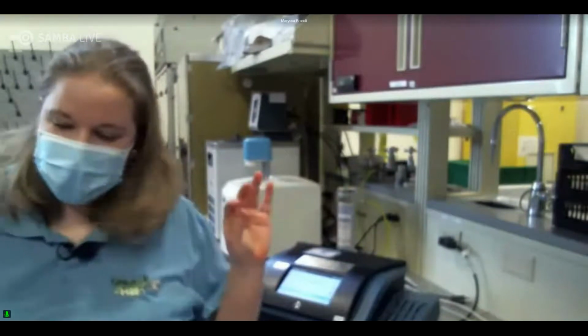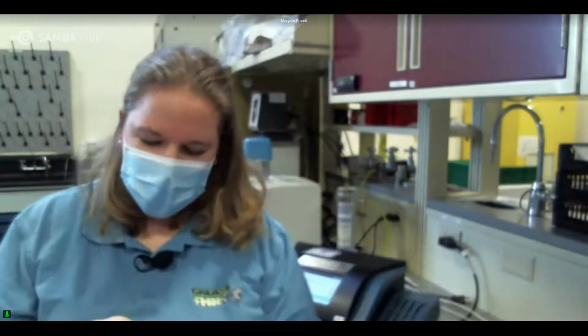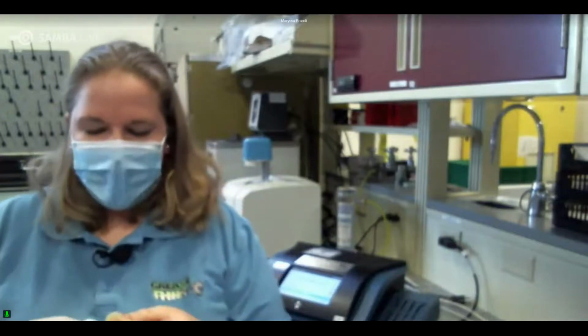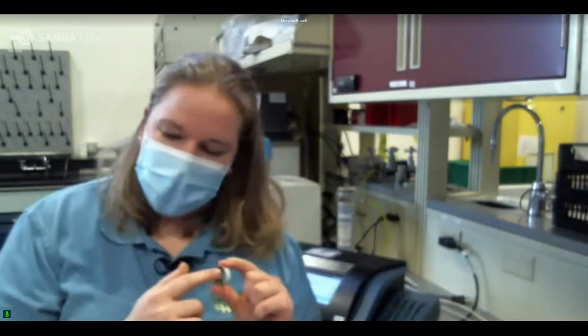So what we do for emergency labs is when it's done, we take it out and we clean it. We clean the vials specifically with soap and water, and we clean the septums with soap and water, and we'll just wash them. And then with the vials and caps, we will just take a paper towel or a lint-free wipe and clean them out. And we will just set those in the hood to dry overnight.